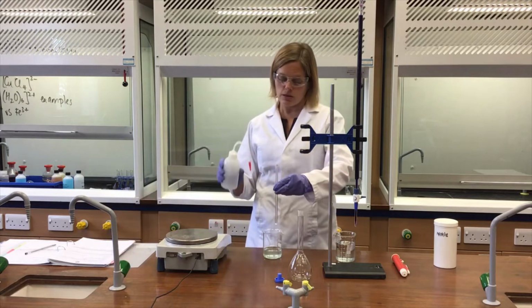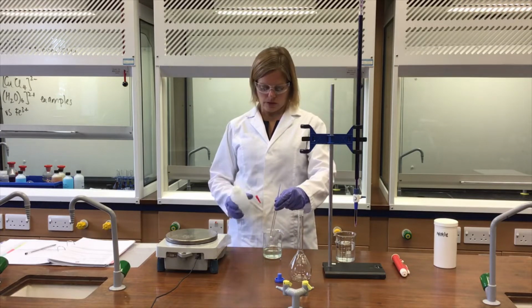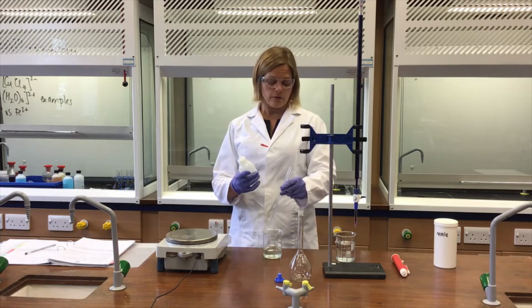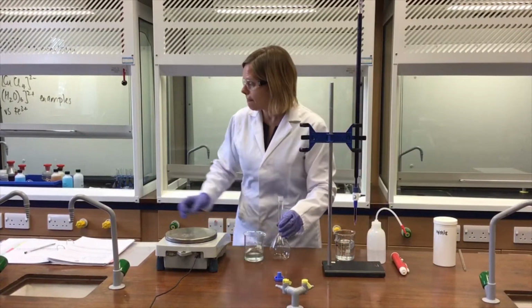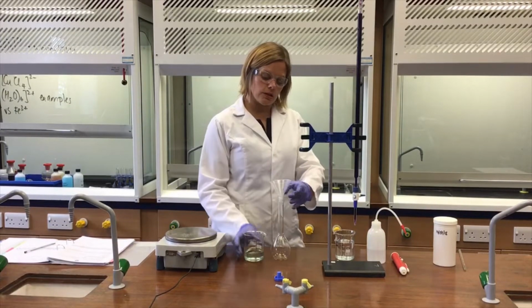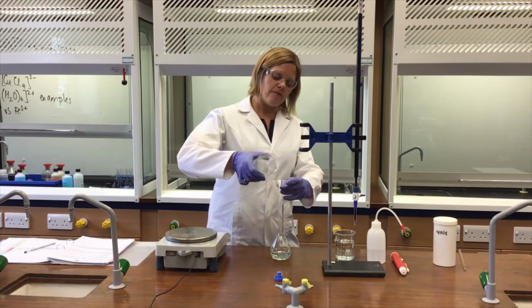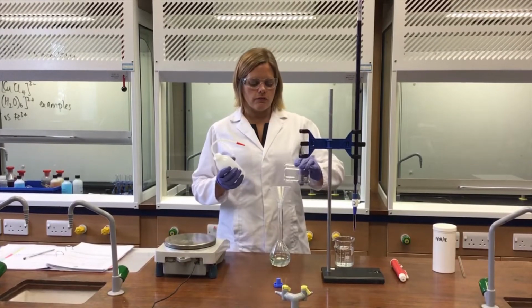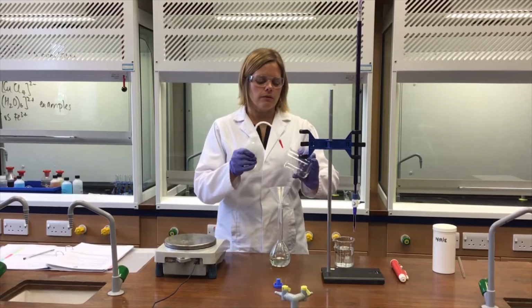I'm now going to rinse the stirring rod into the beaker like so. Rinse that stirring rod into the beaker. So any of the moles of the compound that were stuck to the stirring rod are now inside that beaker. The next thing to do then is to take a nice clean funnel. Pour that solution into the funnel, into the volumetric flask. This one's a 250 centimetres cubed volumetric flask. And then rinse the beaker. So I'm transferring with plenty of rinsings the solution that I made.